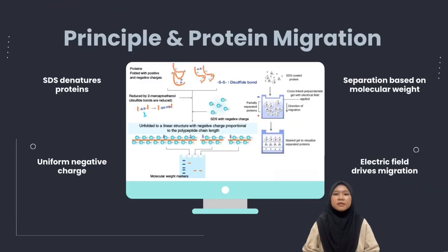To understand SDS-PAGE, we first need to understand how proteins behave. Proteins naturally differ in size, shape, and electrical charge. These differences would affect how they move through a gel. Therefore, before electrophoresis, proteins are treated with sodium dodecyl sulfate, or SDS.